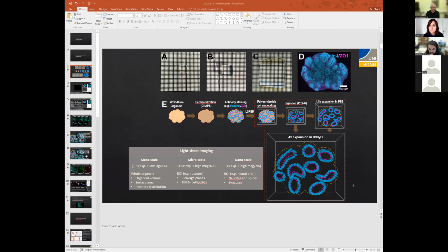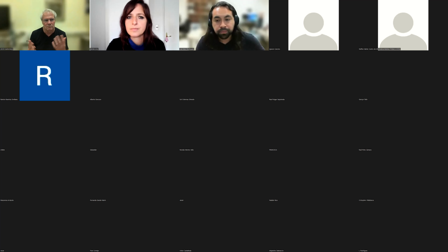There comes a question of what the range of chromophores is. That is like in usual fluorescence. You can do absolutely the same. You need a laser to excite your fluorophore, and you need a filter system to detect it, like in any confocal microscope. You can use UV dyes, infrared dyes, whatever you like.